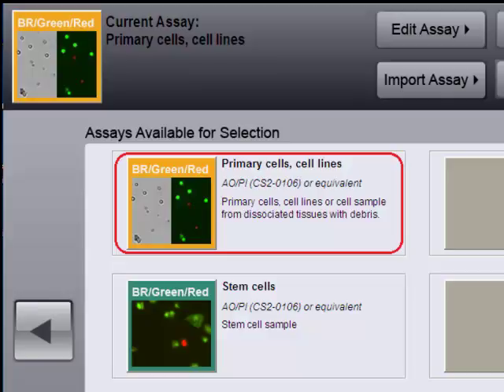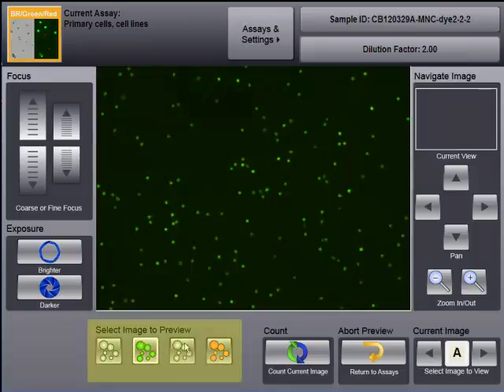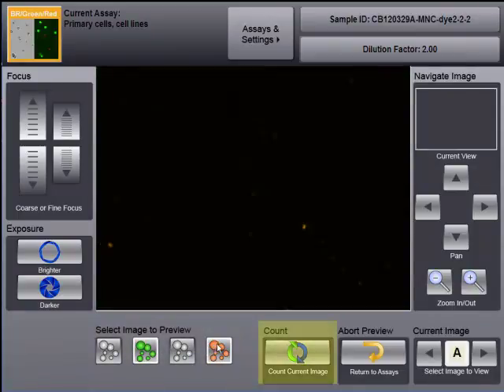A dual fluorescent assay is recommended for analysis of primary cells from heterogeneous samples such as whole blood, cord blood, and bone marrow. After previewing the image, a click of a button starts counting.